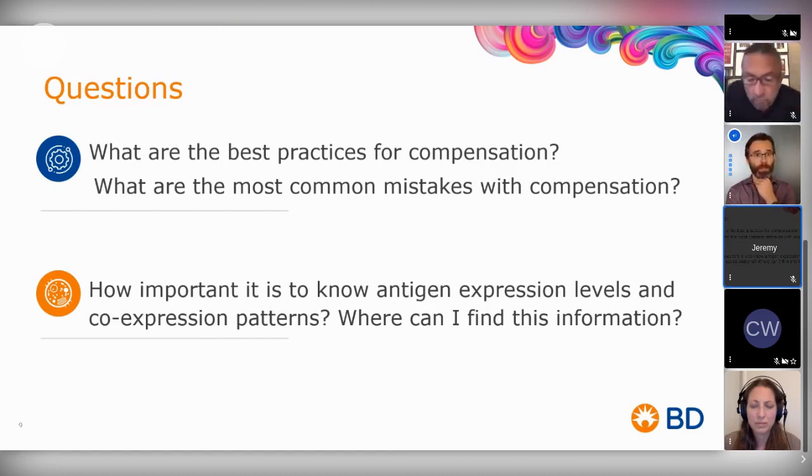It impacts rigor and it impacts reproducibility, because when you look at a paper and you're looking at data and you realize that somebody was just, at the end of the day, tweaking things and matching them, it's very hard to reproduce something like that. And it's also very easy to make mistakes when changing things by hand.